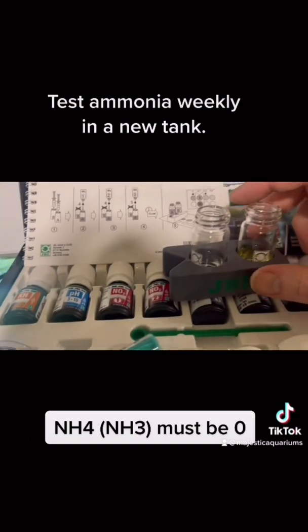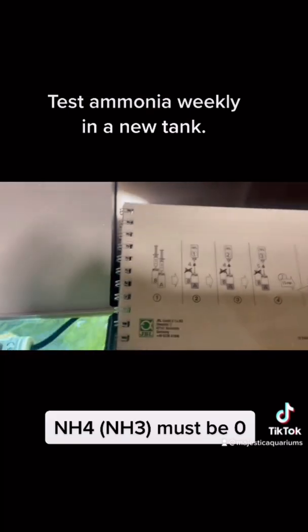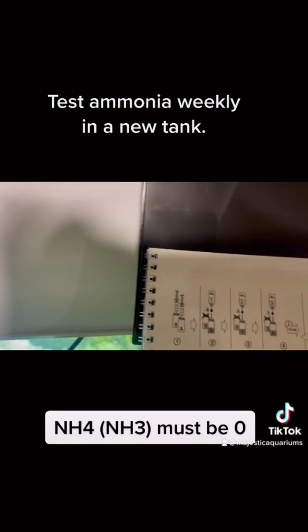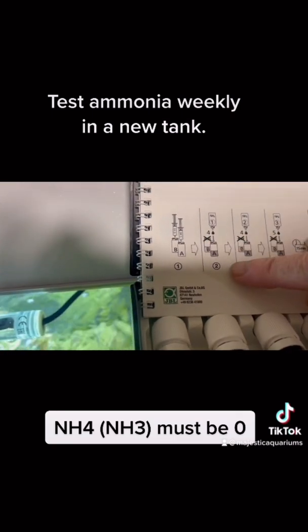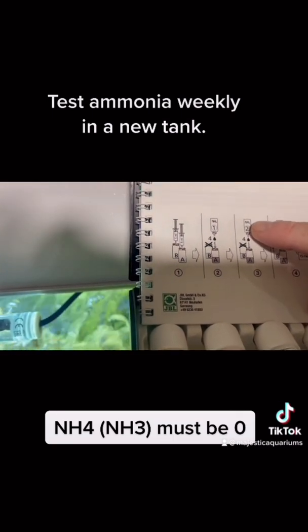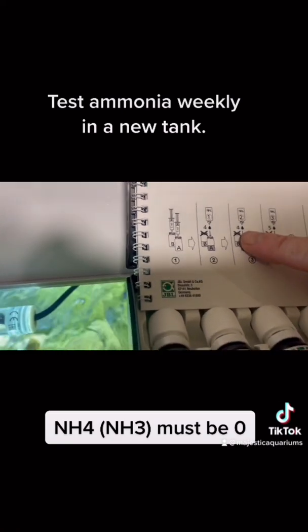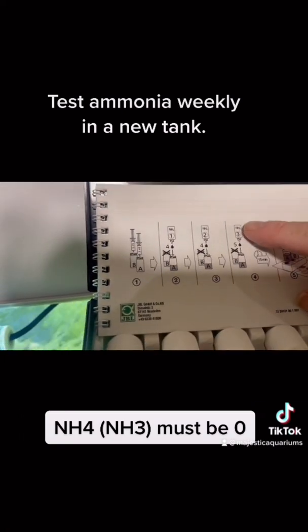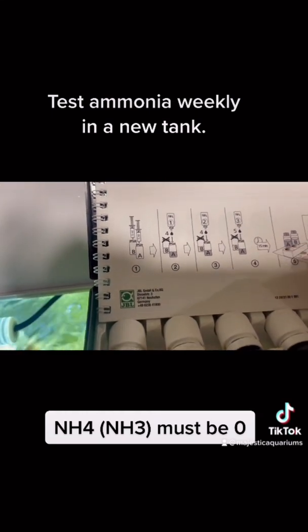What we're going to do is put 5 mils of water in each one of these. Then we're going to get NH4 1, and we're going to put in 4 drops. Give it a shake. NH4 2, put in 4 drops. And NH4 3, put in 5 drops. Give it a shaky shake and wait 15 minutes.